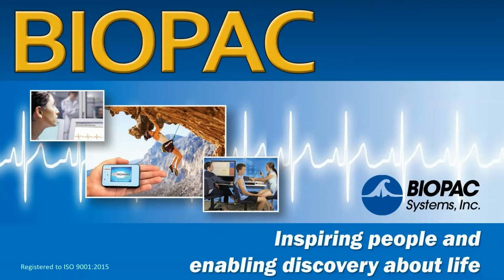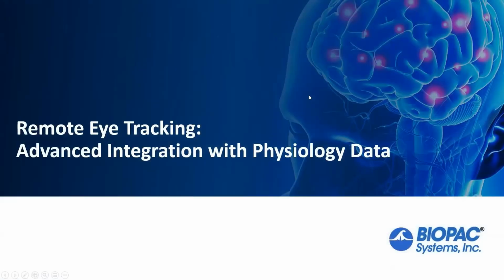I'm Brenda Dettinger from BIOPAC, and I will be your moderator on today's webinar about remote eye tracking and the advanced integration with physiology data that BIOPAC now offers. Today, we're going to explain how to create an eye tracking experiment that combines the physiology data with remote screen-based eye tracking. We have two wonderful speakers and a comprehensive demonstration. It's going to be a very good webinar.